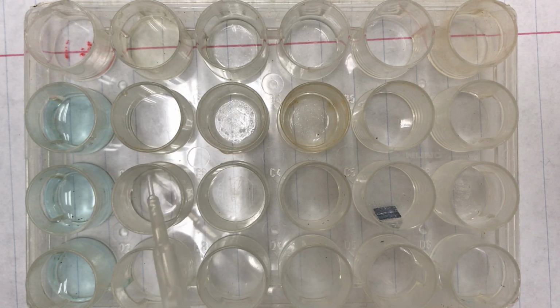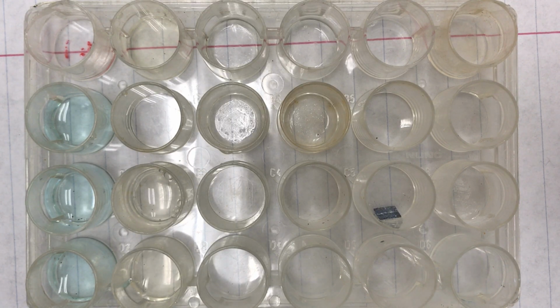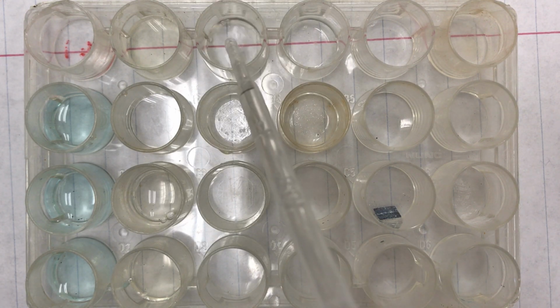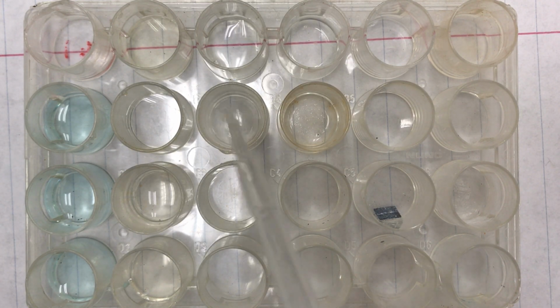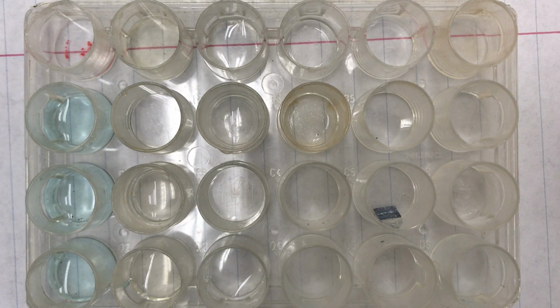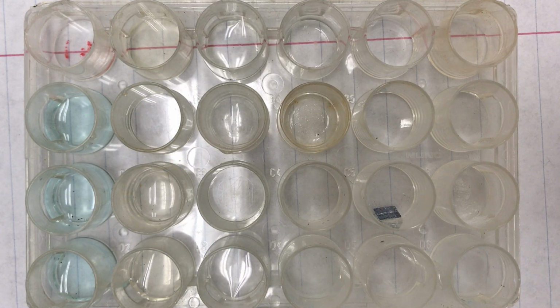C2, and D2. And then it asks us to put magnesium nitrate into well A3, B3, and D3. Again, for each one, making note of the state of matter and color. If you need to pause at any time, feel free to do so.